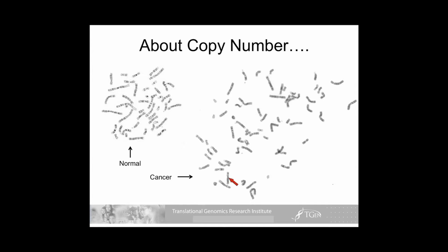But you can see that here's 6p. Here's what looks like 6p, although this p is still not normal. It's probably 6 down to about here, and then I'm going to guess it either went to 12 or 1. I'm not sure because banding's not always great. It looks kind of like this, so it's probably chromosome 1.